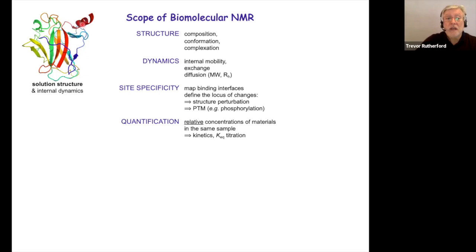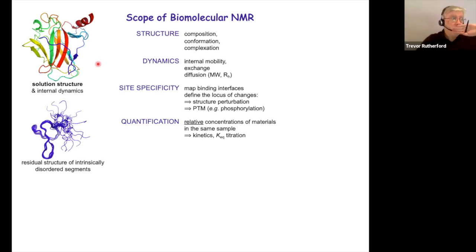And if we've got an overall structural fold, we can look at, for example, open and closed states of particular switching mechanisms. So we get to look at both the overall structure of the molecule and how it's changing with time, whether it's in open and closed states. Remember that proteins aren't static, rigid structures. The dynamics of a protein are very much instrumental in the mode of action and the biological functioning.